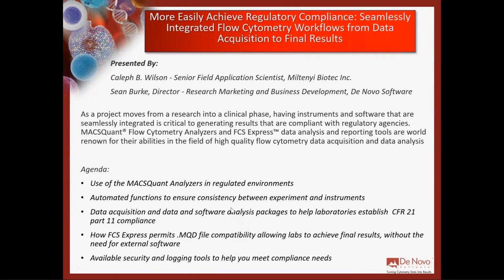Excellent, and thank you very much, Caleph. A great little transition here into FCS Express. And as Caleph mentioned, as you have questions that are coming in, keep typing them in. We see them coming through the Q&A panel here, so we'll make sure to come back in the end and address those. So again, to recap here, we're at that handoff from data acquisition to data analysis in FCS Express.